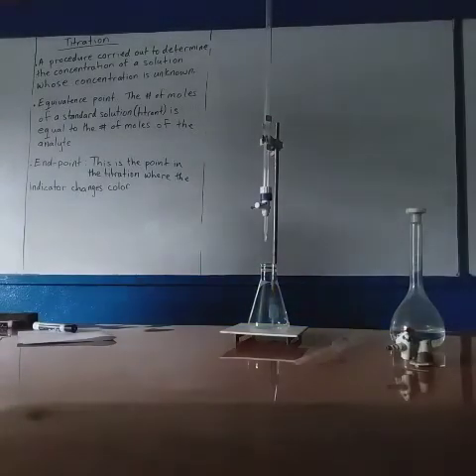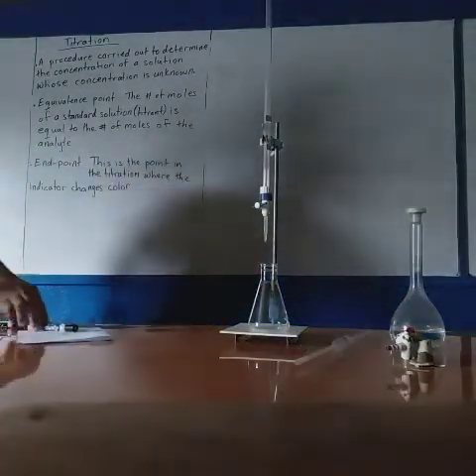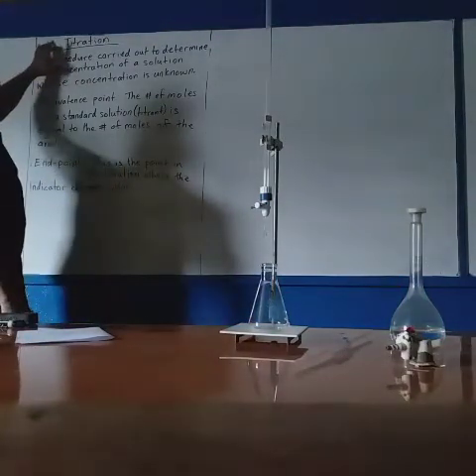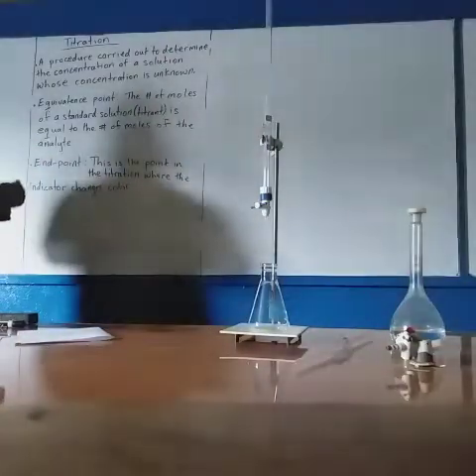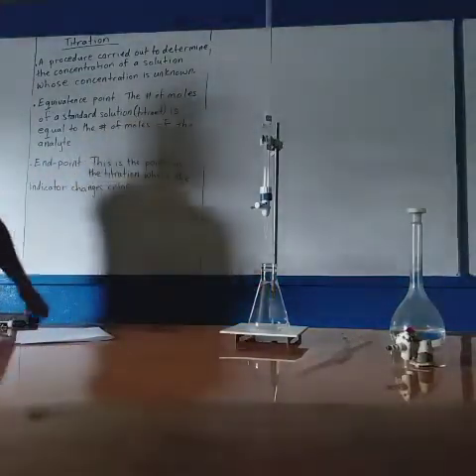Okay, so in this video, we are continuing with volumetric analysis. Now, we will be specifically looking at the procedure of titration. So titration is a procedure carried out to determine the concentration of a solution whose concentration is unknown.